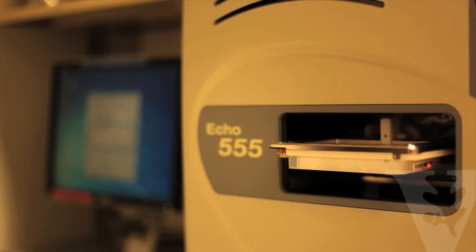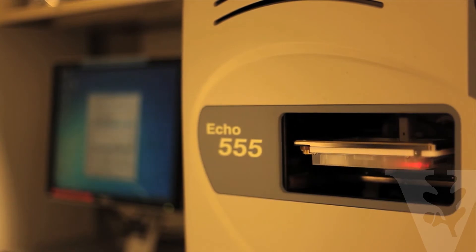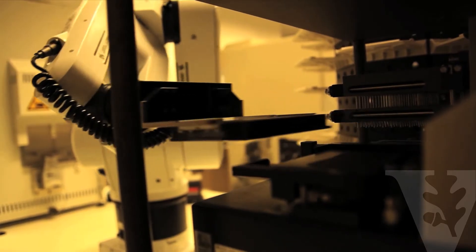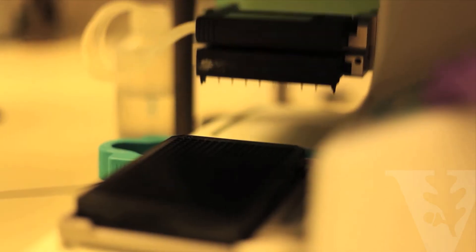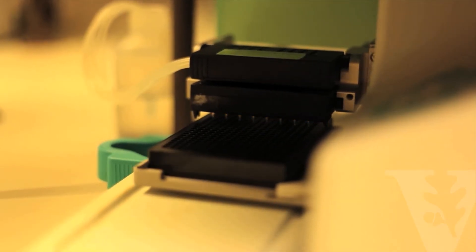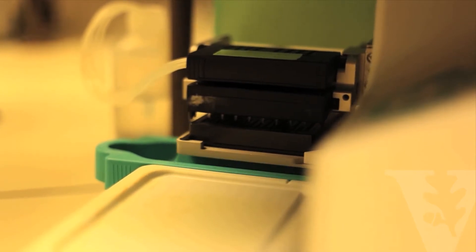To achieve this goal, the Vanderbilt HTS Corps houses advanced instrumentation including automated liquid handling, robotics for reliable plate scheduling and handling, and plate reading with multiple modes of detection including high-content imaging.